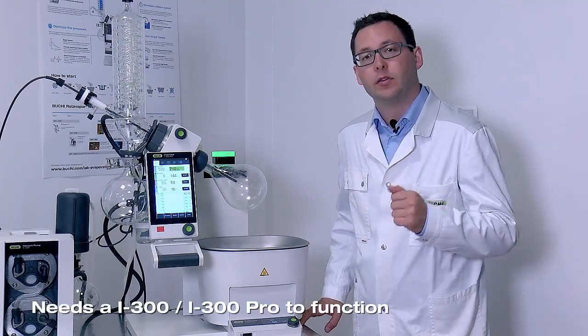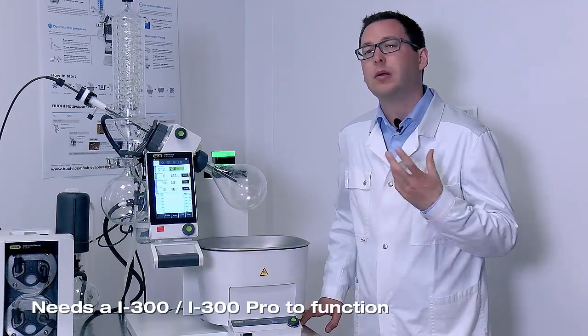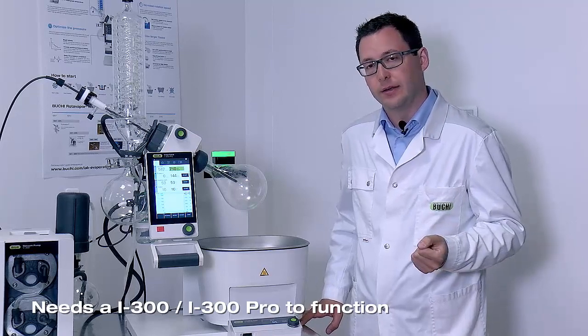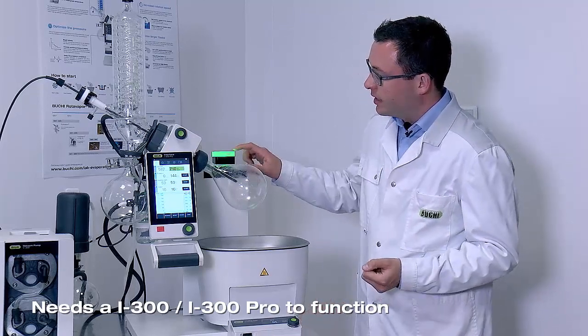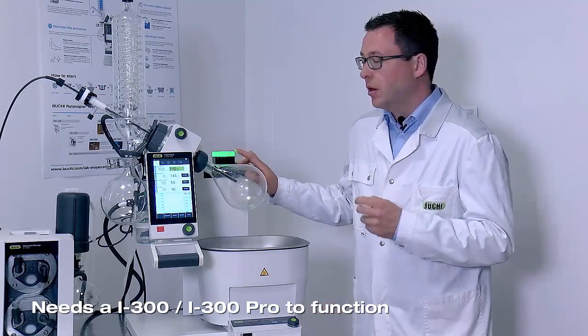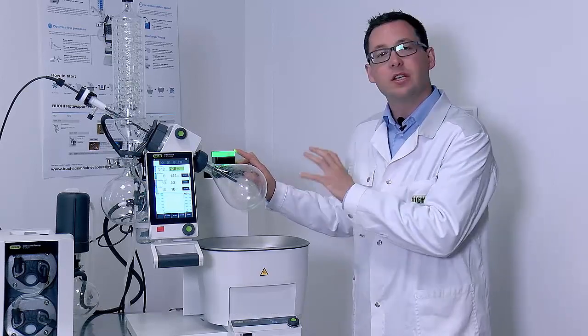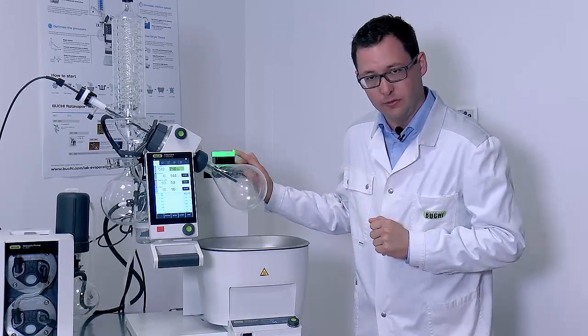The status light has several functions. It is actually a plug and play status light. The first function is a steady green light, which means the instrument is free for anybody to use.